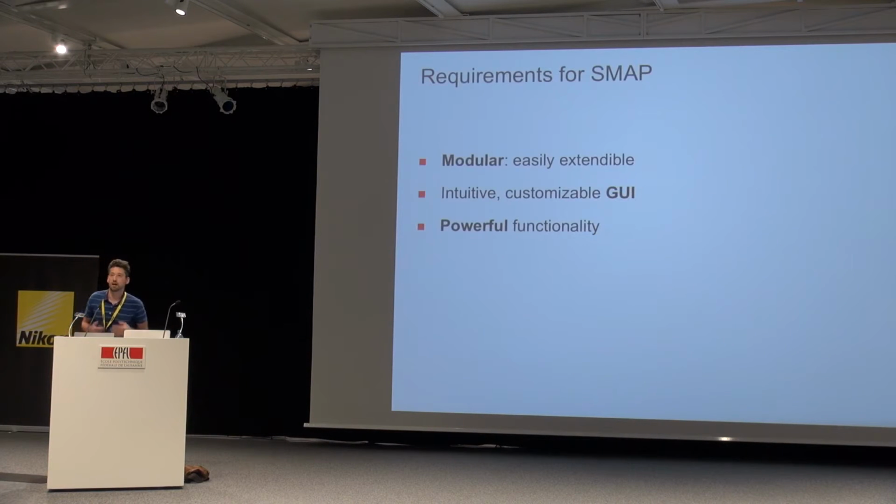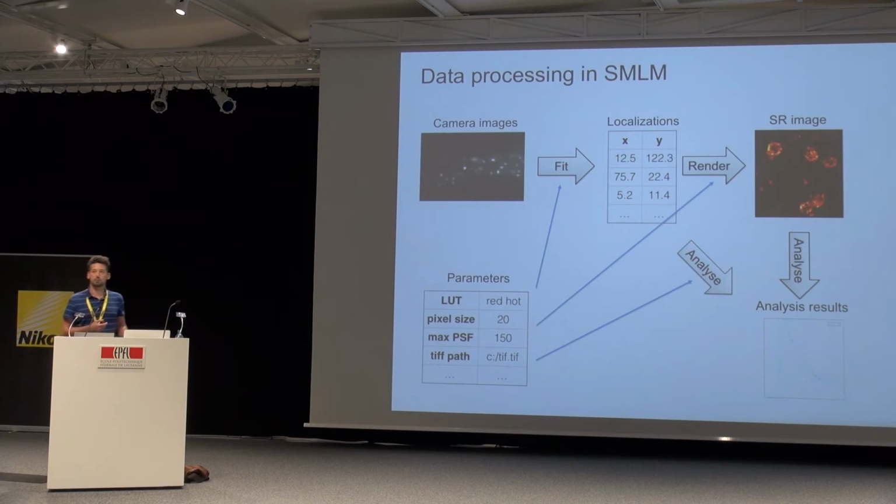So the last time I rewrote our software, I had this in mind, and I tried to write it in a way that it's as modular as possible, but also as easily extendable as possible. For our biological collaborators mainly, and also now for us, I tried to have an easy to use and customizable user interface, and of course I want to have all the great functionality around in the internet and in the community. So here you see an overview of the different analysis steps of typical super resolution software.